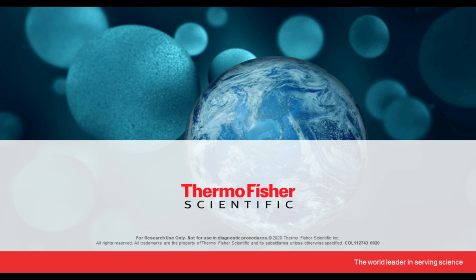As close to perfect as it can get. Because if you are going to have conclusions about a 5 to 15% increase in phosphorylation levels as an important signaling event, then you need to be really sure that that increase is real. And that can only be ensured if you have complete linearity with your normalization method, right? So for such experiments, I would say that the housekeeping protein would not be sufficient.